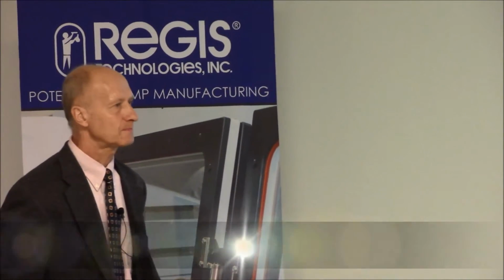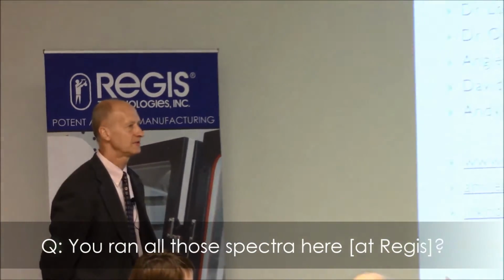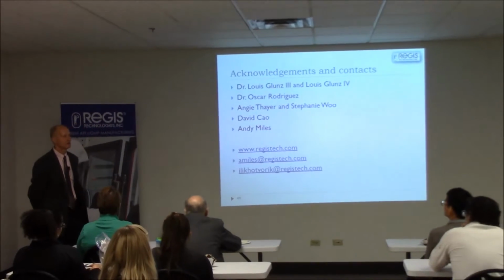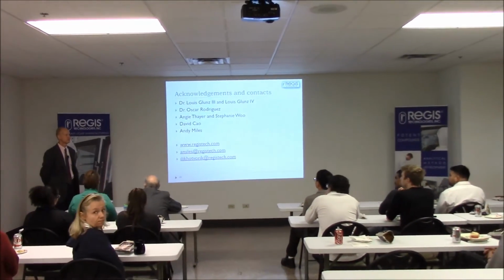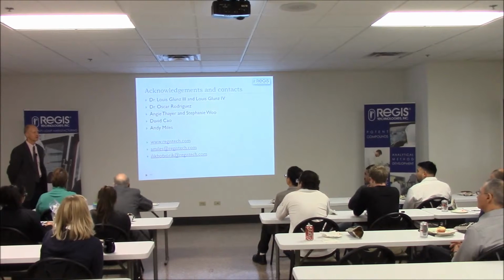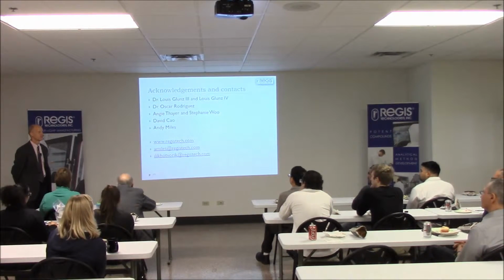Yes. So you ran all those spectra here? Yes, those spectra which were presented were run on our 400 NMR system. If you need to run a higher level NMR, let's say INADEQUATE, it would take too much time probably. It's more economically feasible to outsource INADEQUATE. But those three types of NMR, you can run in the matter of 4 hours on our NMR system.